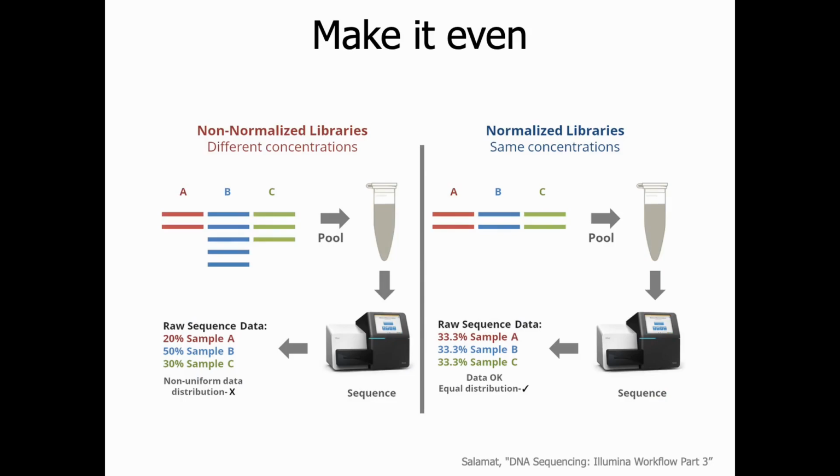This easily exported data is especially handy at that stage in the library prep process, commonly referred to as normalization. When you have hundreds of barcoded samples to pool into one high-throughput sequencing run, they must be combined at equivalent concentrations. Add too much of one sample and it'll steal sequencing reads from the rest of the multiplex samples. Add too little of a sample and you won't get the sequencing depth you need. Getting normalization right is absolutely critical to ensuring you don't have to repeat sequencing runs.